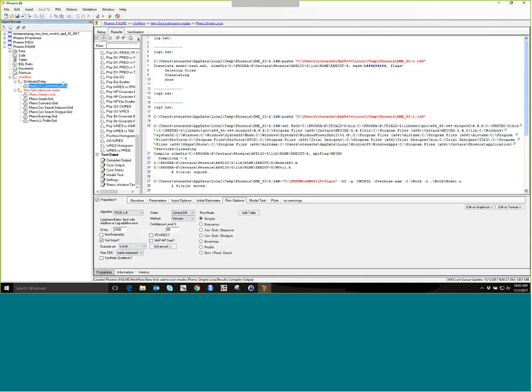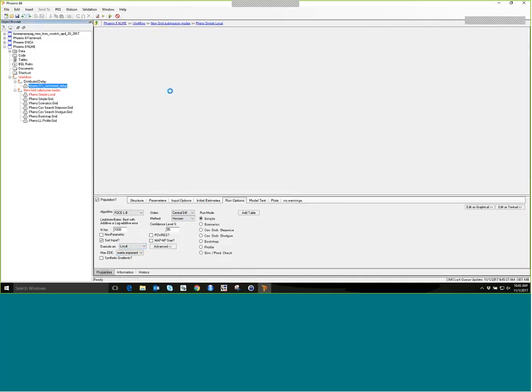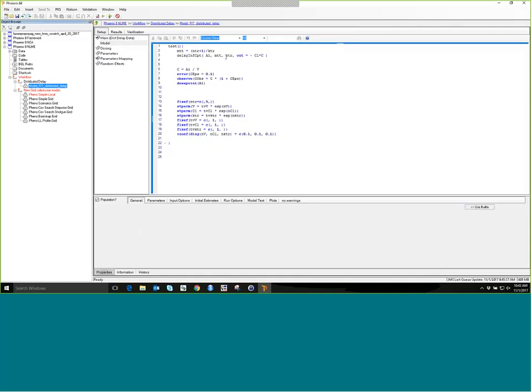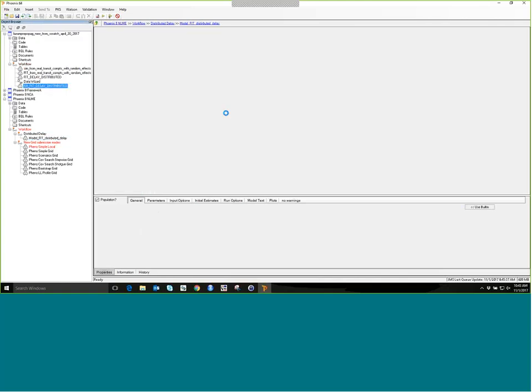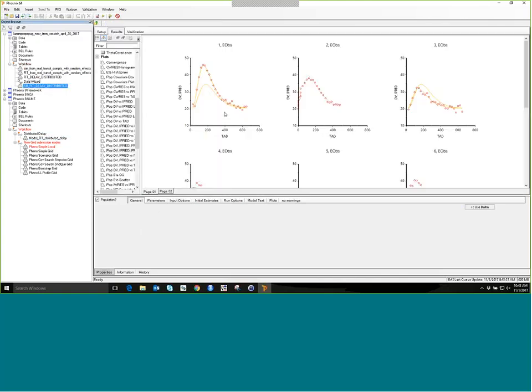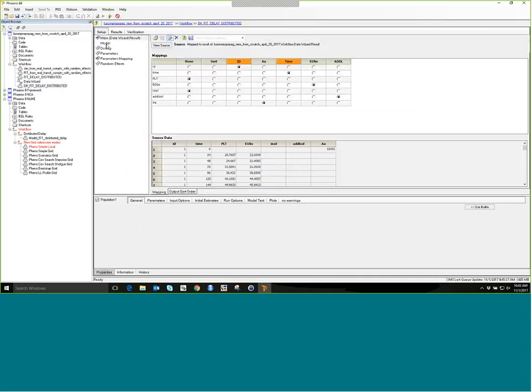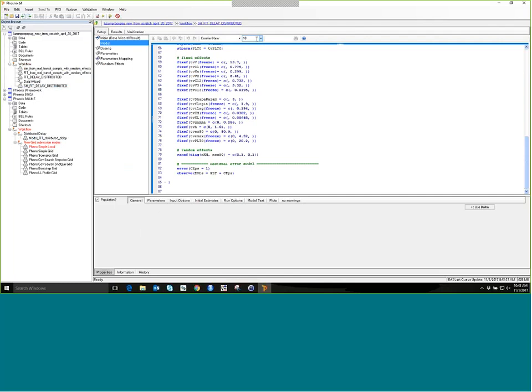The distributed delay, I'll show you really quickly the coding for that and how it's slightly different. It's not terribly different. Actually, I'm going to show you a slightly different model. I think this will be a better model to show you. I can get my text bigger in here.